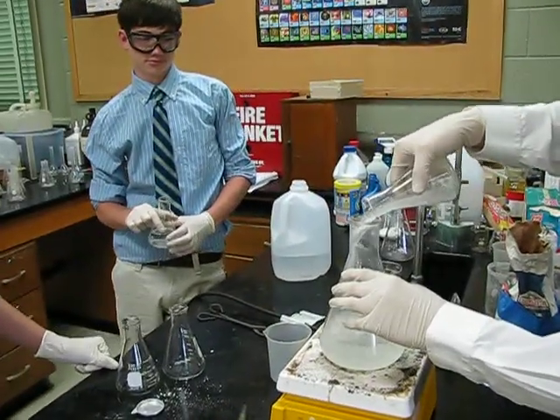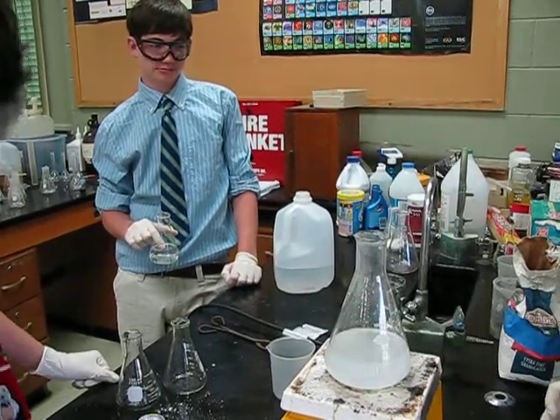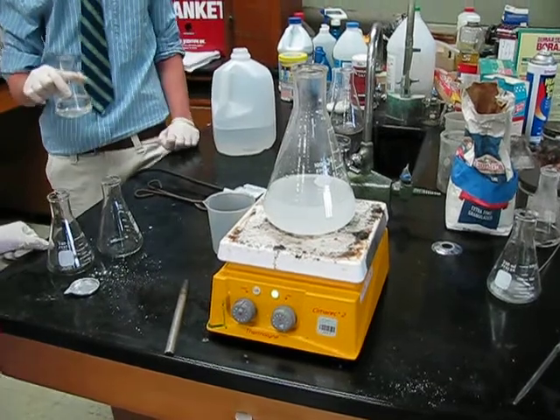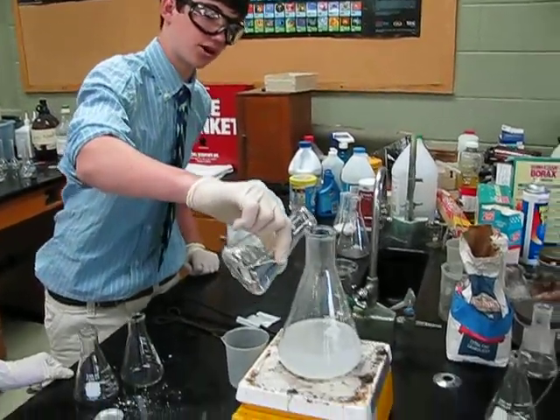So we're going to let these mix a second before we pour in solution C. And in solution C, 30% hydrogen peroxide diluted with distilled water.